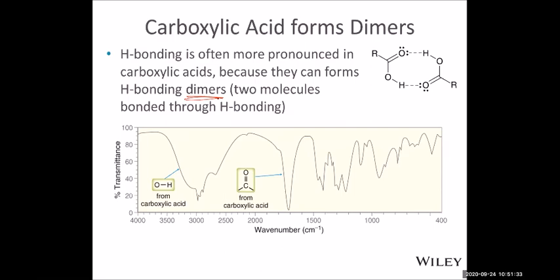In a typical organic chemical reaction, it is often time consuming, and there are often byproducts, kind of messy. So we have a slow reaction, and you want to know if the reaction is complete. Then use the difference in the functional group and do an IR, and we can know if the reactant is still present or how much reactant is still present. So for example, between the alcohol and carbonyl, as the reaction progresses, we should have less alcohol in the reaction mixture, and there will be more ketone formed. If you want to know whether the alcohol is completely reacted or not, just do an infrared.